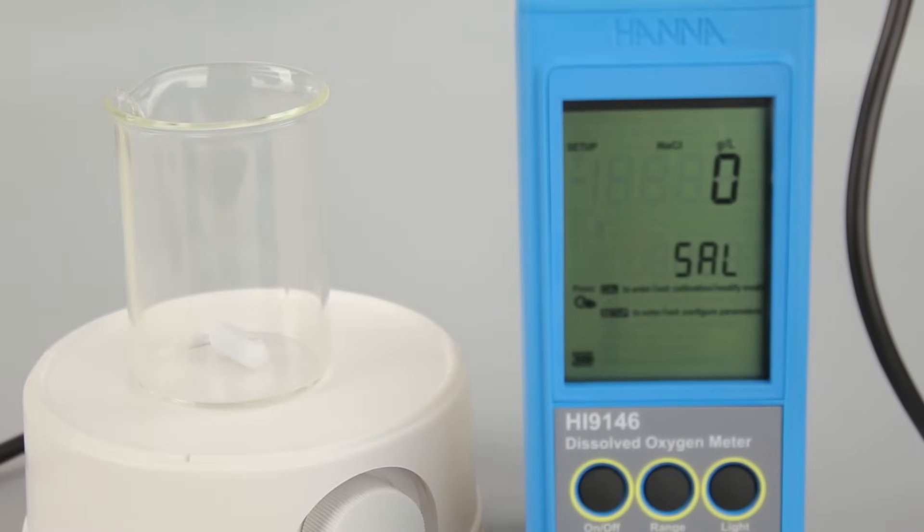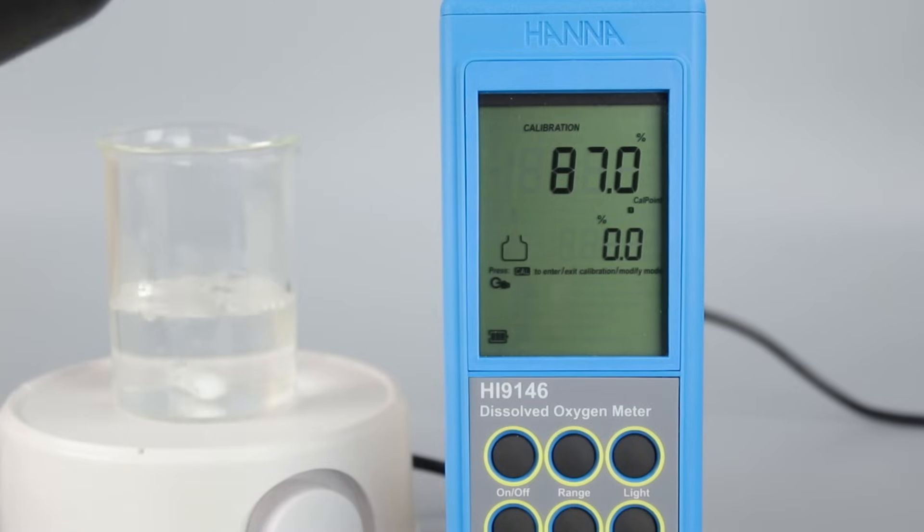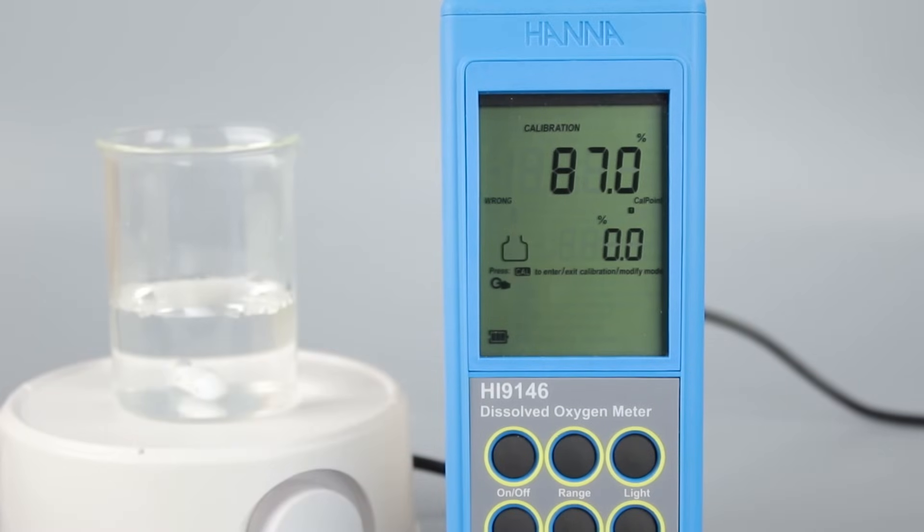Calibration is an important step to ensure the most accurate measurements — we recommend calibrating for each use. You can calibrate at zero or 100% oxygen saturation using one or both of these points. In this video, we'll use the zero oxygen solution to calibrate to one point. Before calibrating, we recommend leaving the instrument powered for at least 15 minutes for best results. While you wait, we recommend setting the correct altitude in the setup menu. To calibrate, pour a small quantity of your HI7040 zero oxygen solution into a beaker.